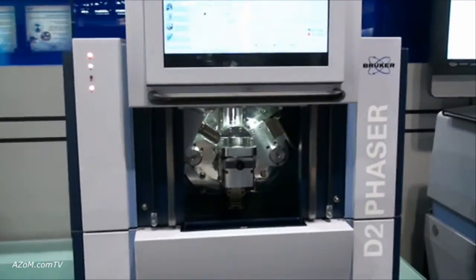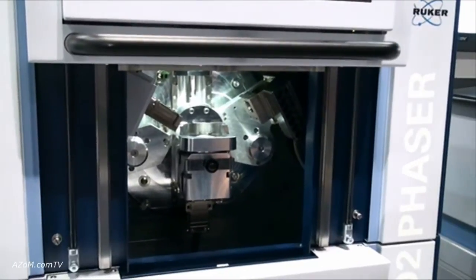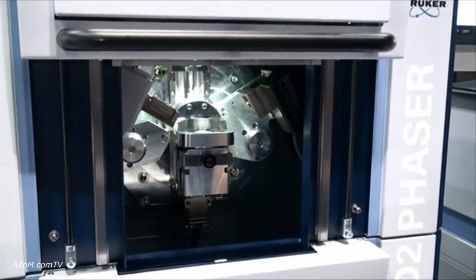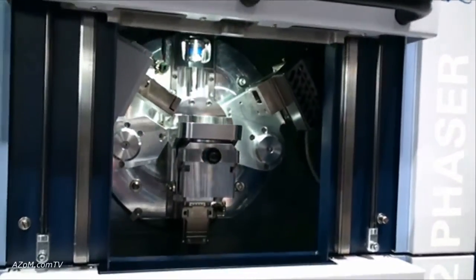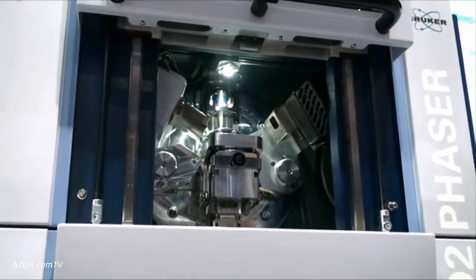Inside the D2 Phaser, we start off with a compact goniometer and standard sealed tube X-ray tubes. These are available in copper, cobalt, and chrome — the same tubes you use in your laboratory now. It runs at 300 watts of power, which means these tubes should really last a lifetime.